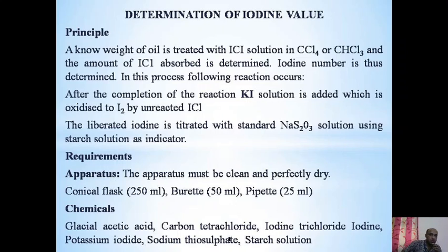Hello everyone. Today we will see how to determine the iodine value for a particular oil or fat. This particular analysis is an example of iodometry. A solution of iodine is yellow or brown in color.